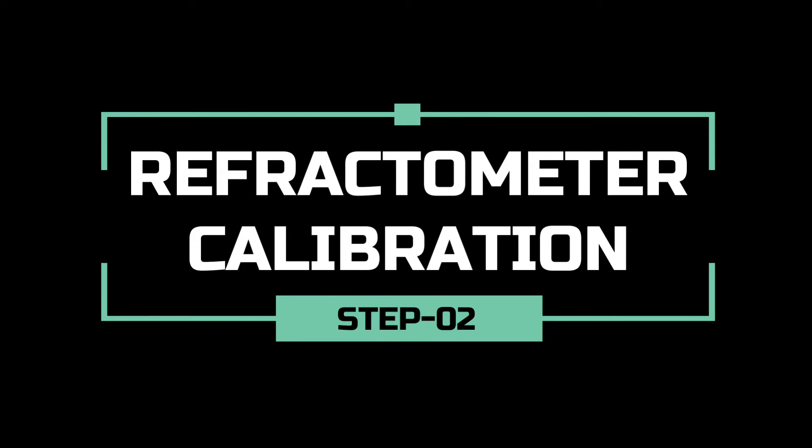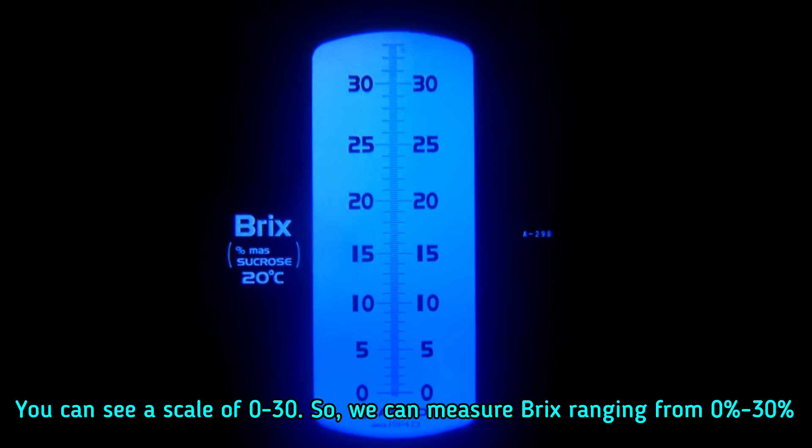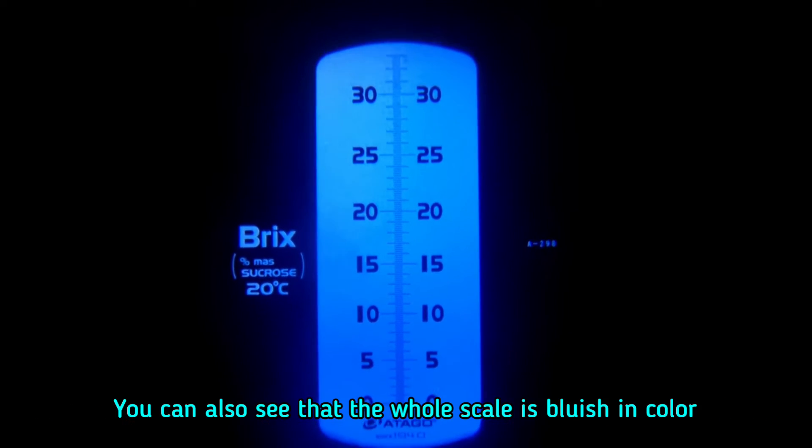Now we have to calibrate the refractometer with distilled water before going to the main test. You can see our scale from 0 to 30, so we can measure Brix ranging from 0 to 30 percent.